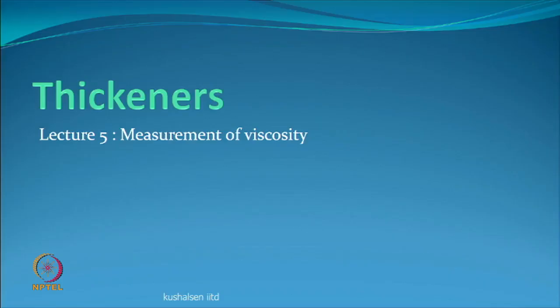So, mainly we will be talking about the viscosity and how it is important to us from the point of view of printing, and how we can generally measure it. There may not be all methods that we are going to be talking about, but some of the methods which the textile processing person may use, and that is what we would like to understand.